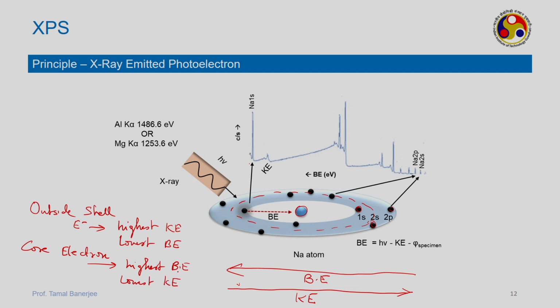Okay. So, whenever you plot, this is the plot you see. What are these? This is one of the peaks for the sodium 1s orbital. Now, what are these in between? It means that continuously there are primary electrons being scattered, maybe elastically, inelastically. So, you are getting primary electrons, and then like this, suddenly you get a peak.